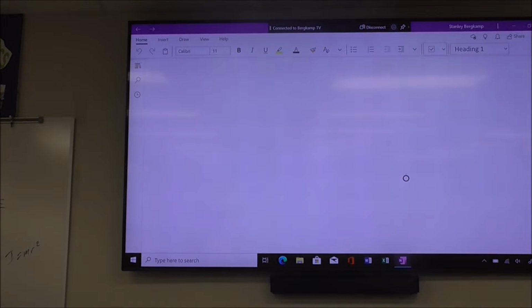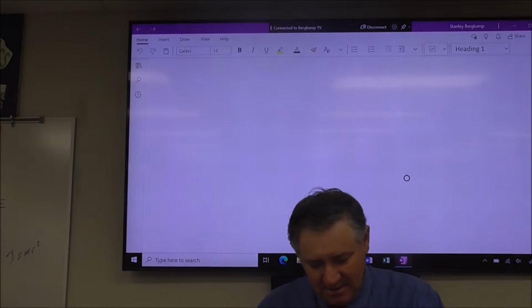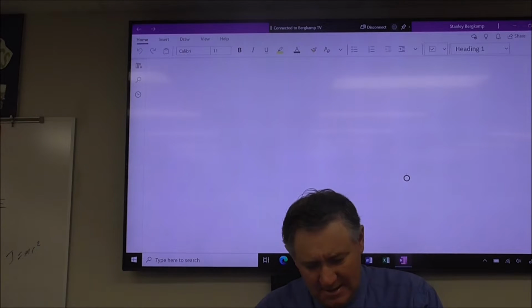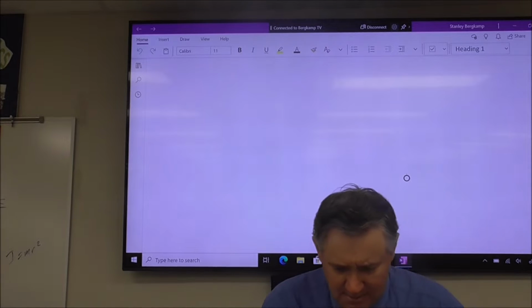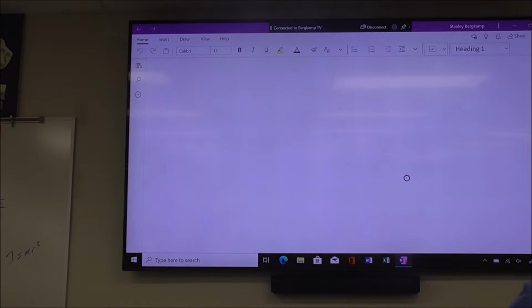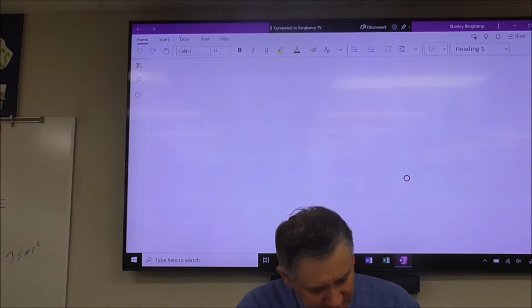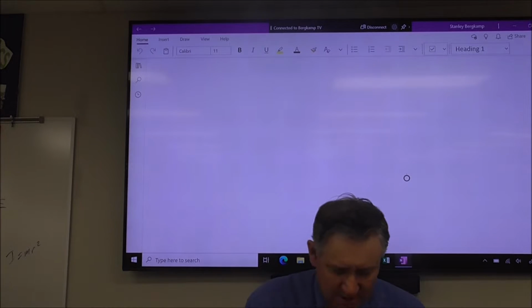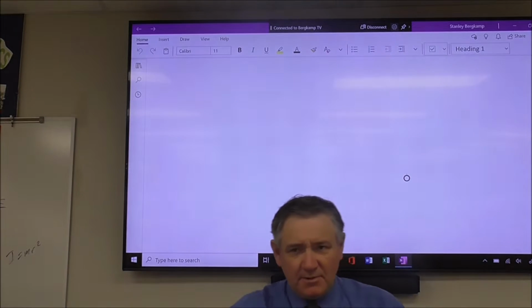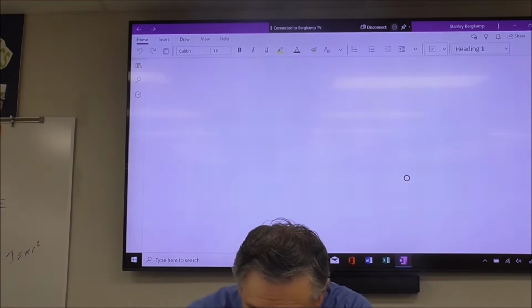All right, so let's start off with a couple of demos here. We'll take some water, add my favorite indicator, phenolphthalein, and I got that. Then the first one, I've got chunks of calcium, okay? That's a technical term. So it's got this grayish solid. So I'm going to react calcium and water. Let's just start with that idea.